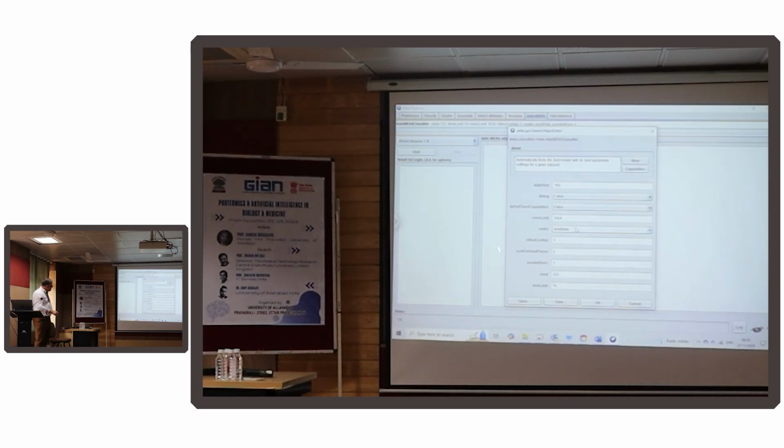The seed is a random number seed. So basically, if we run this with the same random number seed for the same data for the same time, we'll probably get a very similar or the same answer. The random number seed is how it's randomized, so we can fix the way it's randomized by using that particular seed. Change the seed, you'll get a different set of results.